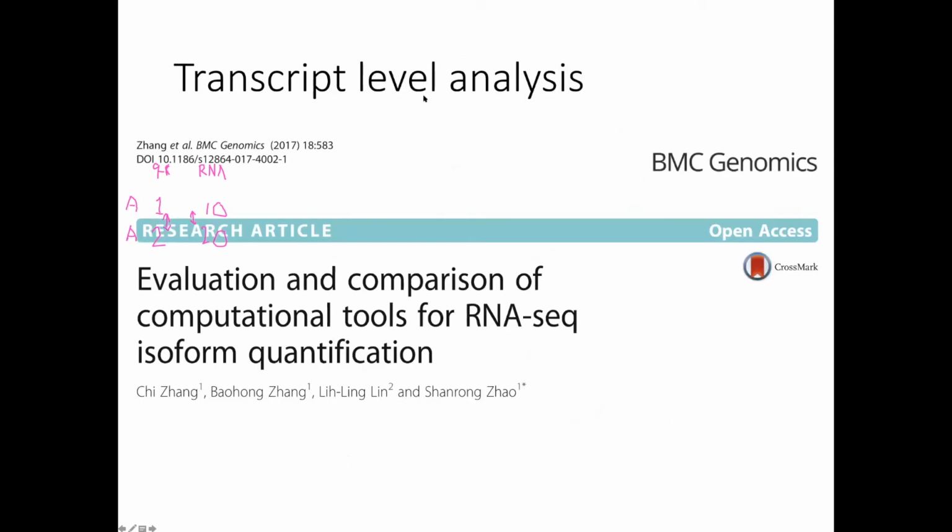Can I comment? Yes. Do they claim it for all of the methods for qPCR? Because it seems like now the gold standard for cDNA synthesis in qPCR is random hexamers with oligo-dTs. So that's the cDNA priming, whereas the priming for cDNA in RNA-seq is only poly-A. Yeah, so that's oligo-dT.